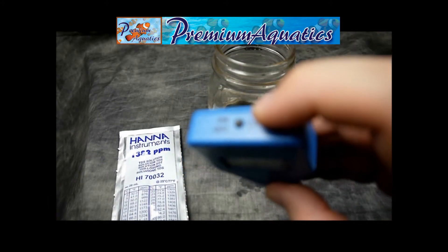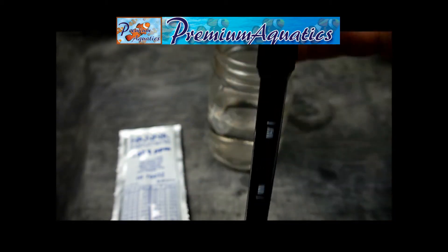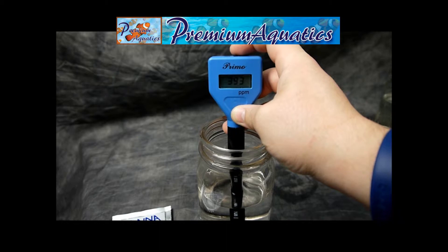For here we'll just test some regular tap water. We'll push our on/off button to have our LCD screen come up, and we're ready to put it into our water. As you can see here, we're reading about 388 ppm in this water right now.